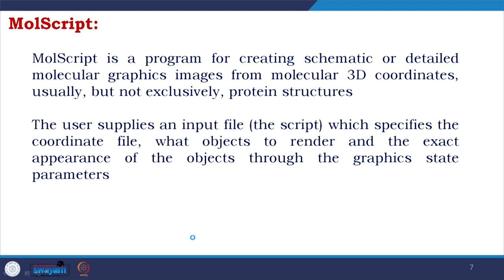The user supplies an input file. Actually, when I started my career as a PhD student, in the initial years, though PyMOL had already appeared, we used to make figures using MOLSCRIPT. It is not that we had to write the entire script. There are a lot of scripts available. We take those scripts and change them according to the requirements of our structure.